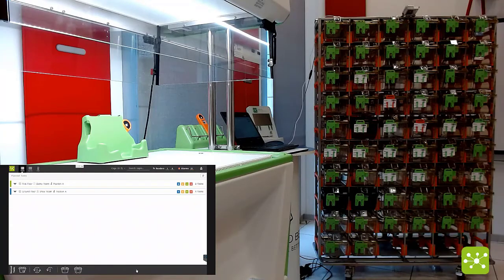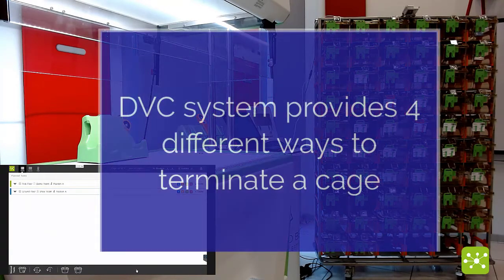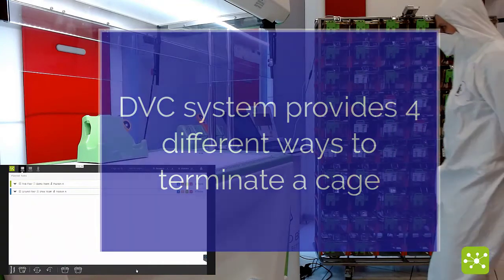In the DVC system it is possible to terminate cages in four different ways.